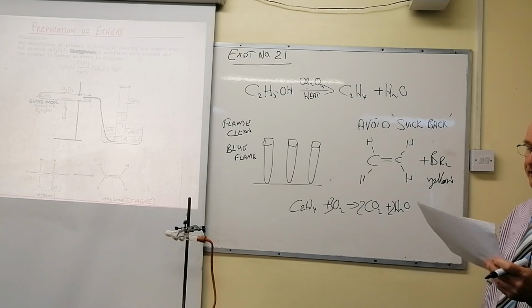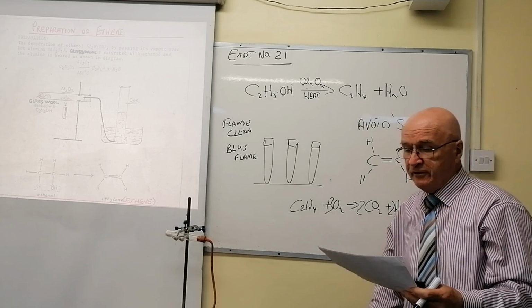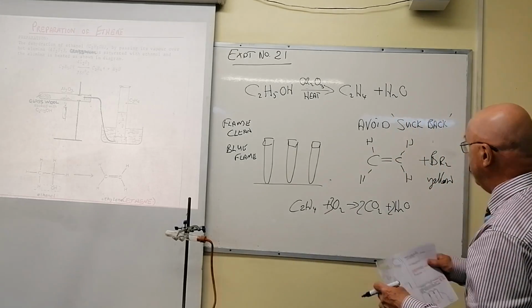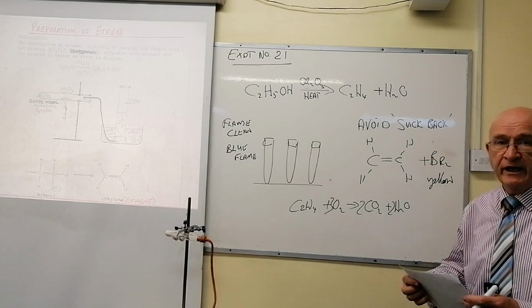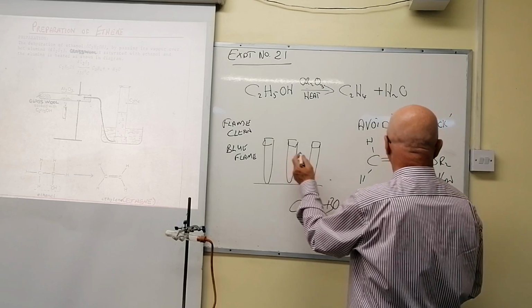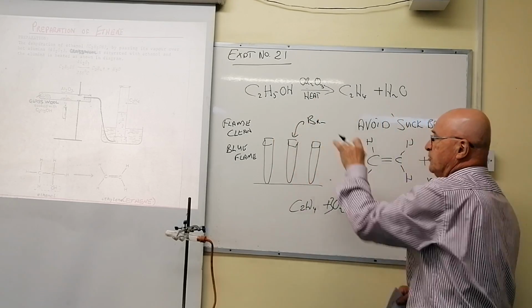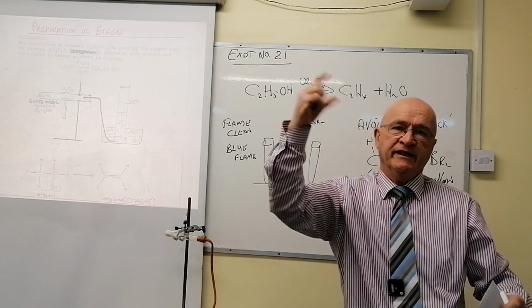And then you're asked to burn it, and you're asked to describe that. That's fine. Now, I have there in your notes, you mix it with bromine and KMnO4. Now, they're not looking for equations for them. If you take a tube here and you put some bromine, Br2, into it, you pour it in, put the stopper on and shake it.